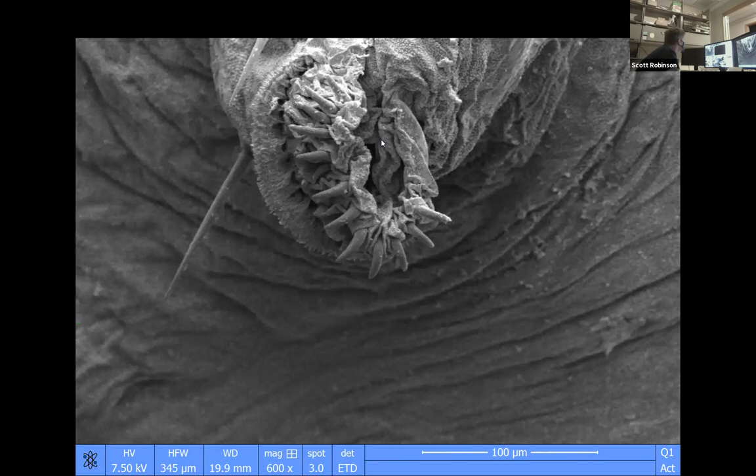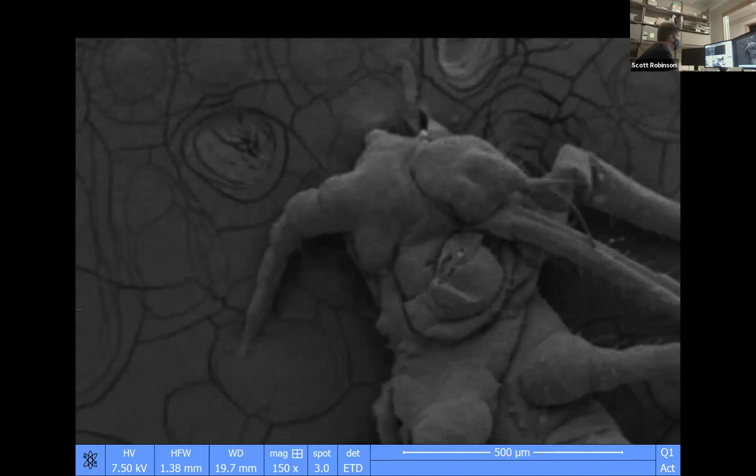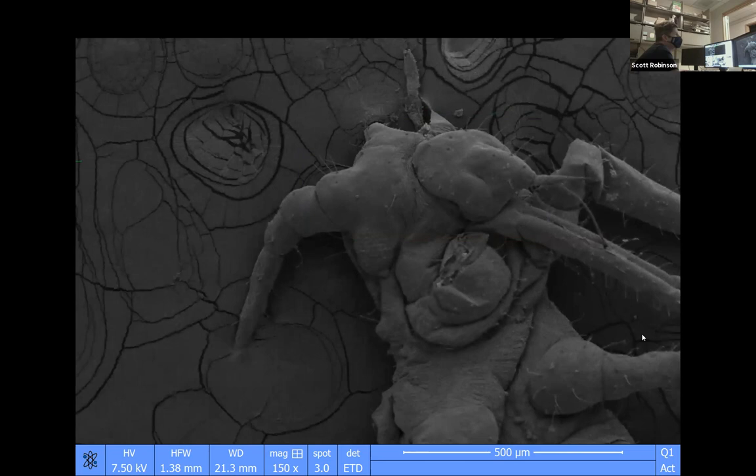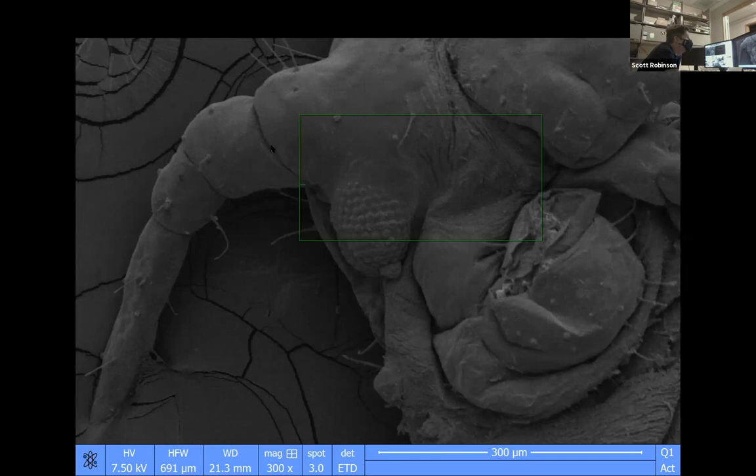So I want to go try to find the aphid. There we go. Yeah. So I just confirmed via Google that the full leg is called the proleg, and then just the end is called the crochet. Yeah, that's because nobody wanted to say that they actually have more than the normal number of legs. They're still insects, but they have more than six legs. Because the term leg was referring to the same homologous structures between different species.